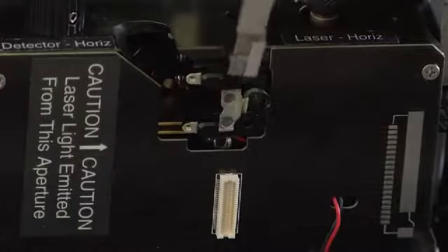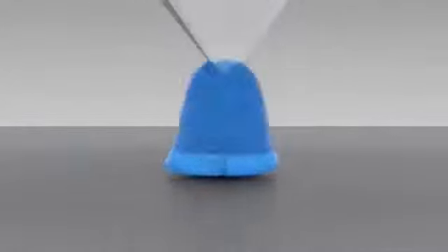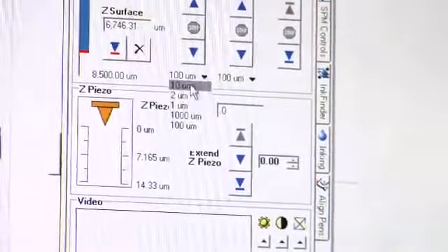Like a microscopic quill pen, DPN allows Carlos to load a tiny stylus with a solution containing metal ions and organic ligands. So when you approach this AFM tip to the surface, it automatically creates a water meniscus that is used to transfer these molecules to the surface. The process is considered a soft lithography technique, which means the printing should not affect the reactivity and functionality of the substances he deposits. For me, it's the most powerful technique in order to direct write soft materials.